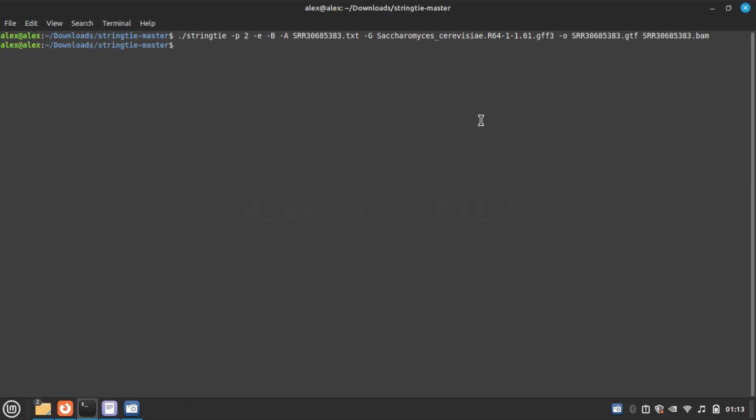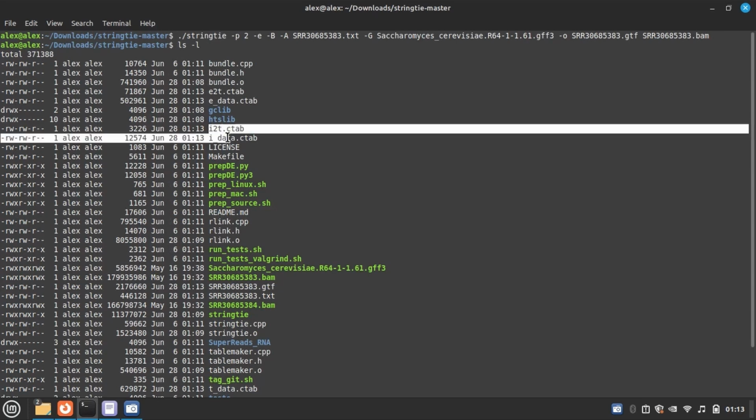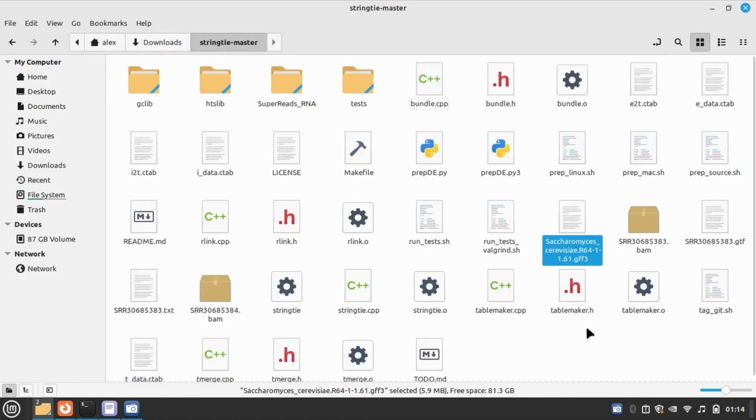Okay, it is done. So let's check the list. So here you can see the list is comparatively long. Here are some files, this one, and let's check it in this directory.